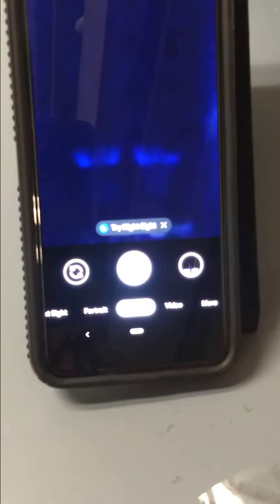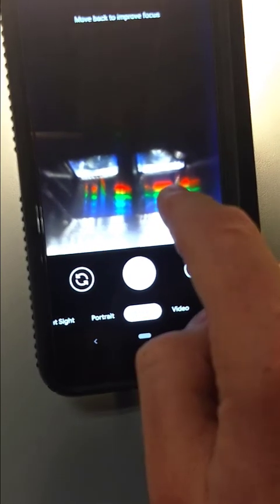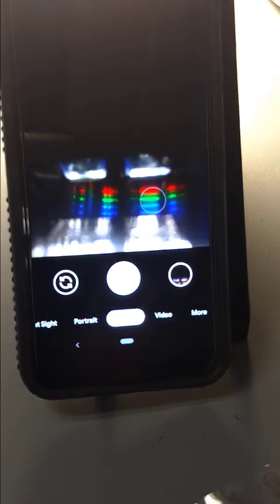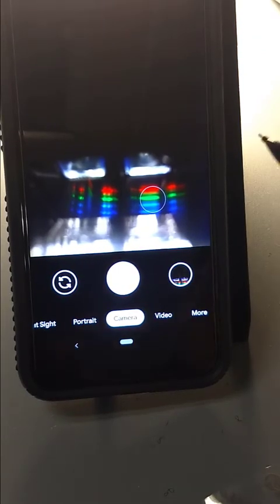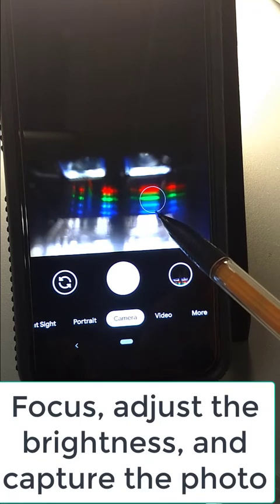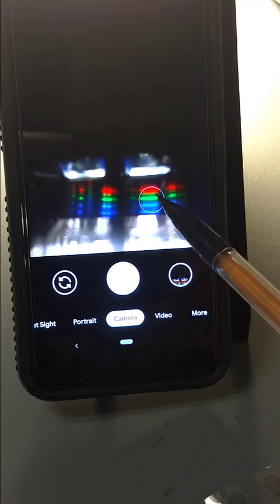Okay, go ahead and turn the power on to your compact fluorescent source. What we can see here, and I'm going to need to focus back on there. So you can see a pretty distinct difference from what we saw in our continuum source or our broadband incandescent source. Now we have very discrete bands of light here. Those bands are coming from the atomic emission of red, green, and blue lines that are strategically engineered into the compact fluorescent light to give you the perception of white light, even though it's not the true white light, which has a continuum of colors between it. You're only seeing those three discrete bands, and then your eyes are fooled into thinking that is white.